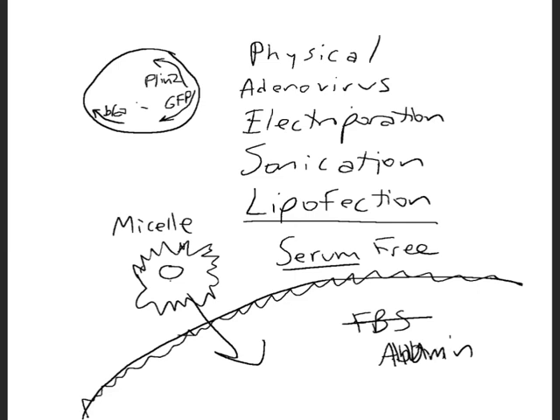Well, remember that this albumin also deactivated your trypsin-EDTA that you were using to trypsinize the cells, and it got rid of the enzyme. Well, the same problem occurs here. If you have media that has the FBS, it will actually prevent this membrane from forming around it, because the lipofectin reagent and the albumin will interact with one another, thus neutralizing your ability to make these micelles. So that's typically why when we do a transfection, it says serum-free. You've got to make sure that it doesn't have any FBS in it, otherwise it just won't work.